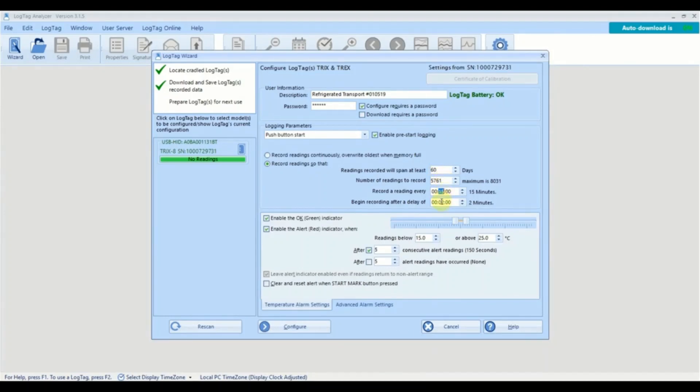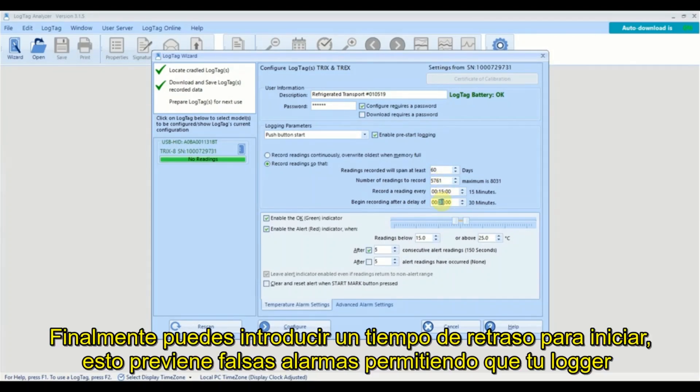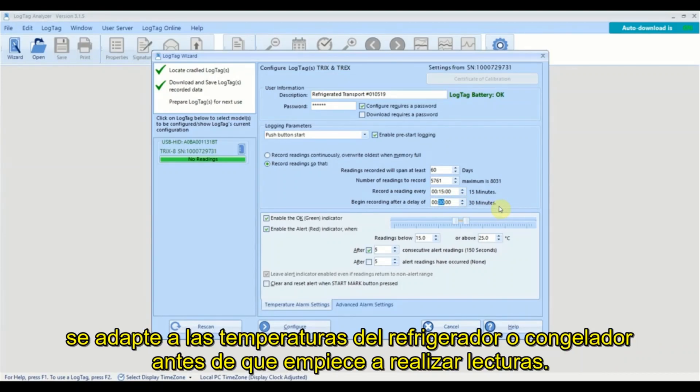Finally, you can enter in a start delay. Adding a start delay helps prevent false alarms by allowing your logger to adjust to the fridge or freezer temperature before recording starts.